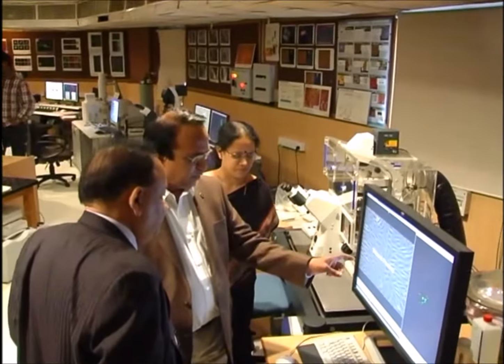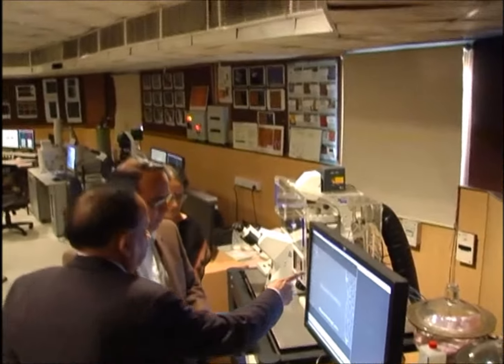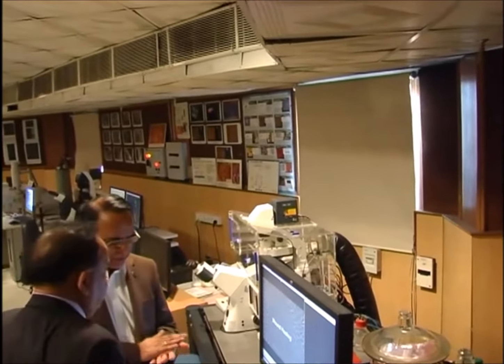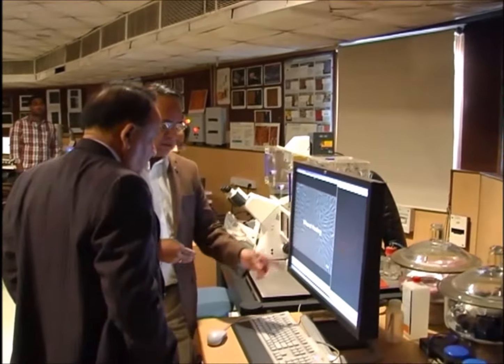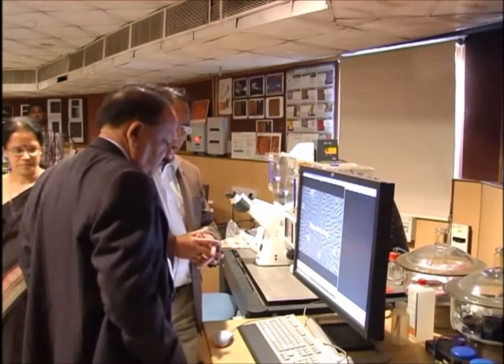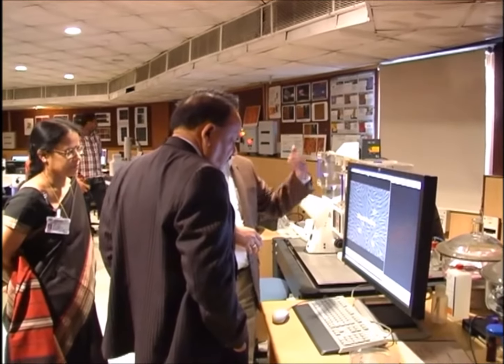That's the mission which will hopefully be made. These are the older machines, they're important. This is the wound healing assay. Cells are dividing and moving, healing the wound. Cells are coming together, closing the wound. Now we'll measure how much time it takes to close the wound. It is about 24 hours for this one. So we'll measure how long it takes.